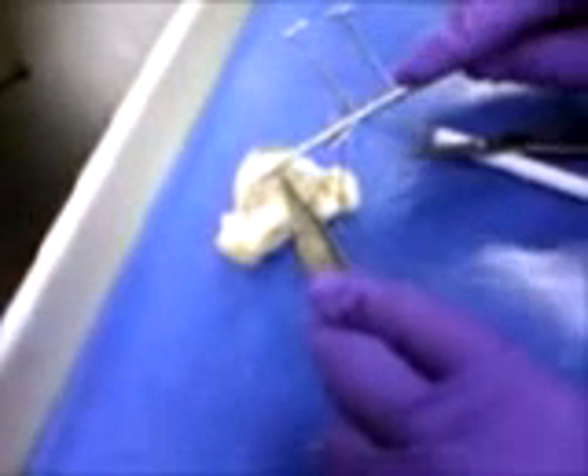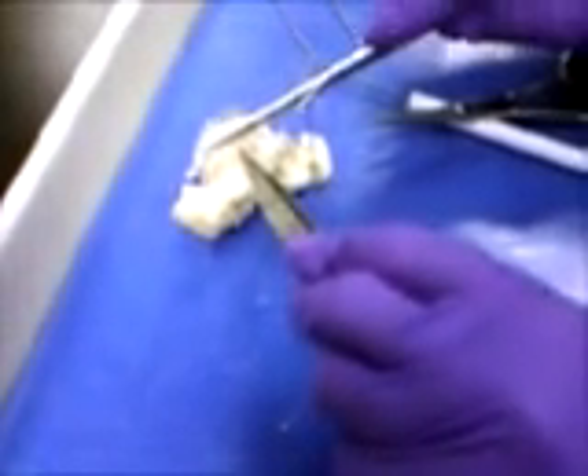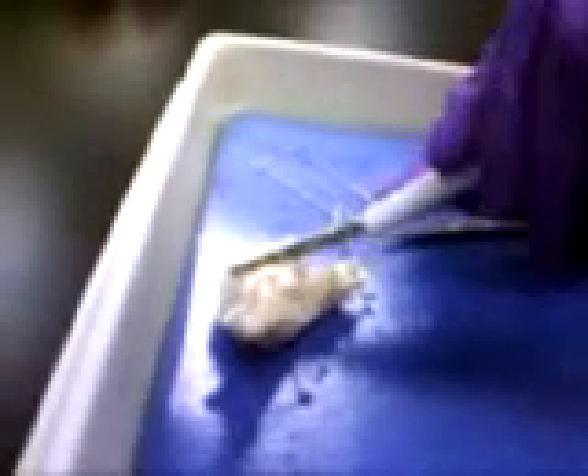Do you want to cut it, Tyler? You want to do it? I don't think you're carving up there. It's kind of slippery. It's hard, you guys. It's hard.